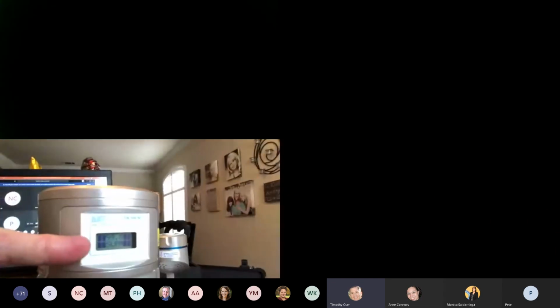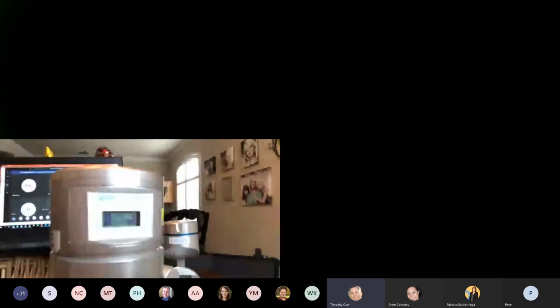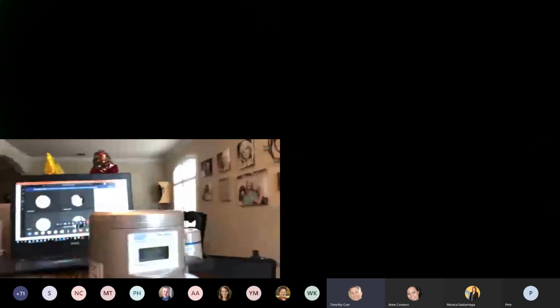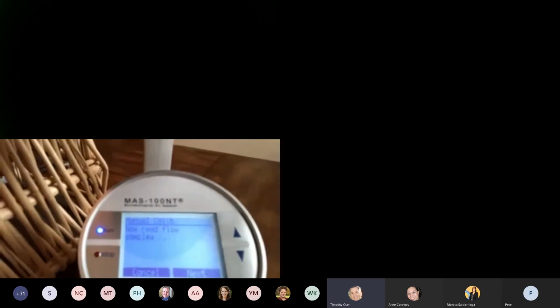Okay, so we've got our flow samples, and this is reading 99.8 standard liters per minute, 100.7. So I read my three samples. I feel really good. I'm within my plus or minus 2.5%, 100.6. I'm right at 100. In fact, we recommend this to be a little bit higher because if you're running 100 liters a minute, you want to make sure that you get more. If something goes wrong, you want to make sure that it's more, not less. So you want to end up maybe calibrating it to 100.1. We recommend that. And that's perfectly normal.